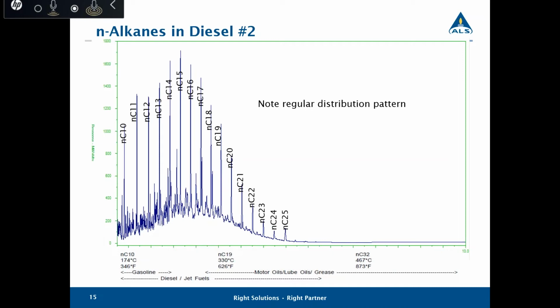Because they are very evenly distributed, they are quite easy to find on your chromatograms. As the chain of the N-alkanes becomes longer, obviously the peaks become smaller and wider. The presence of the alkane peaks and the UCM complex is strong evidence for petroleum hydrocarbon contamination.